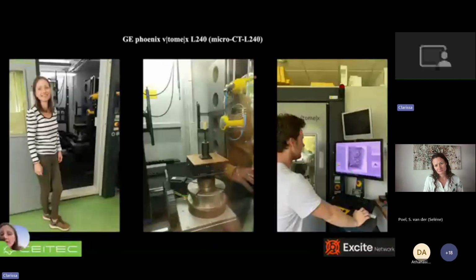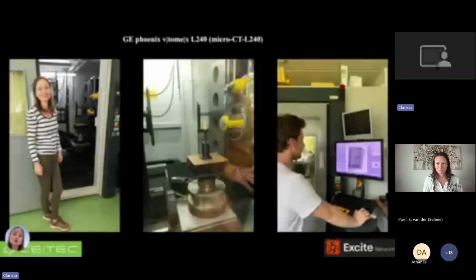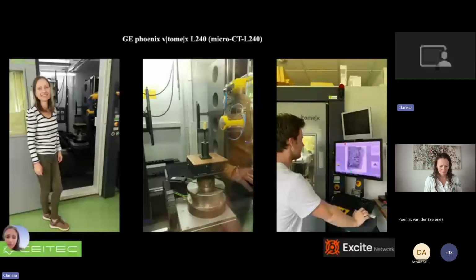And here I put this photo on the left so that you can see the dimensions of the actual scanner. It's in a little room, but the actual machine is pretty large. And here you can see the holder, if you can see the pointer, hopefully, with the little sample being held in the styrofoam. And then once you close the door, the magic is done by the various operators that work there. In other words, finding the right parameters. And then you just let it go for the various hours. These scans usually took between 2 or 3 hours each. And you got about a 5 micron resolution.